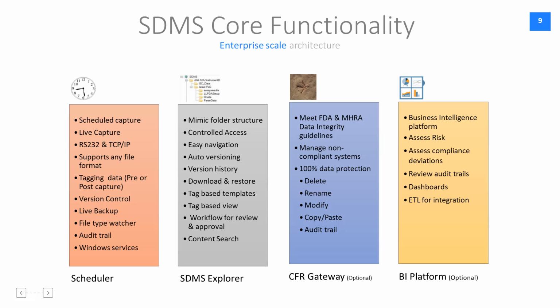Post-tagging is very good for PC-based instruments where the instrument might generate the data file at any point in time. Once the data has been uploaded, users can manually tag the data with appropriate metadata.